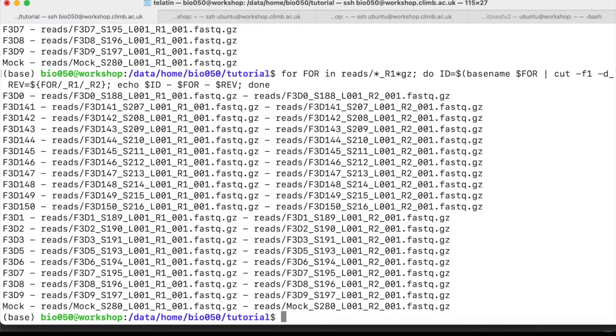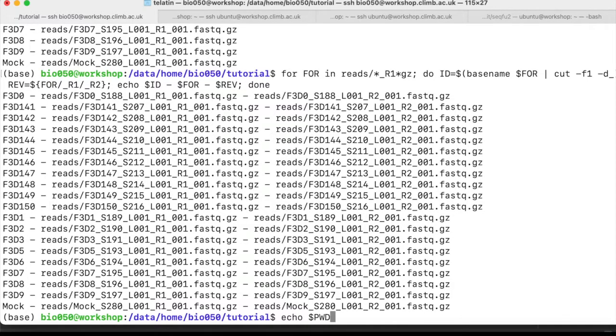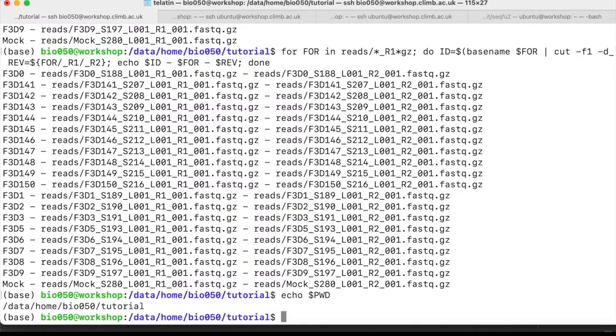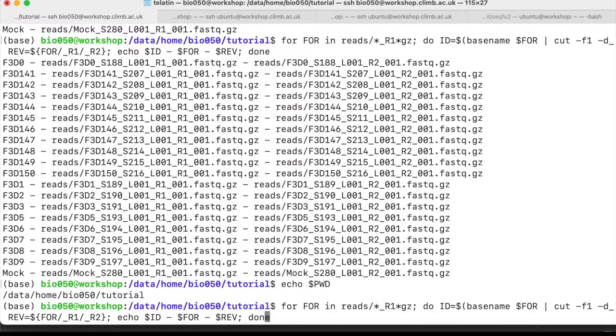But we need the absolute path, so if we remember that pwd is a special variable with our current directory, we can simply prepend this to our files like this.